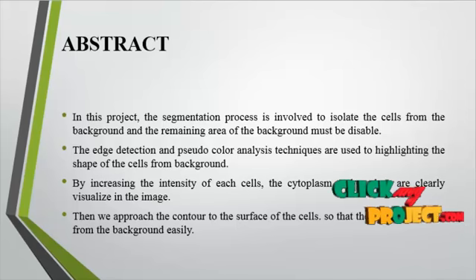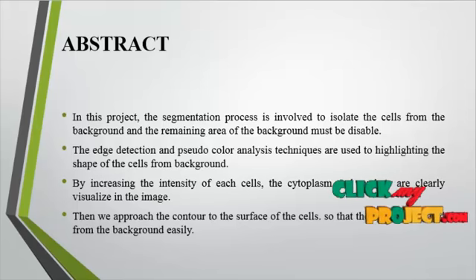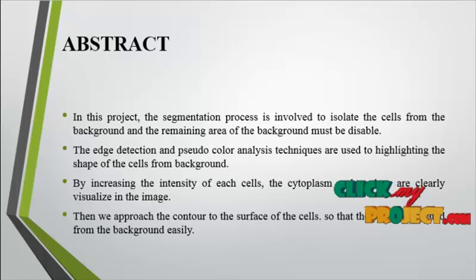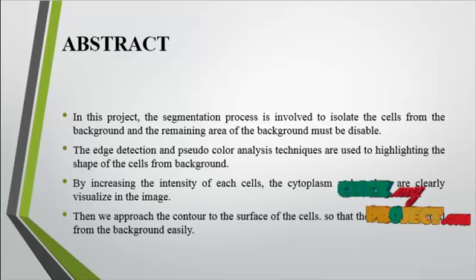The proposed method is feasible and effective for cell segmentation as well as cell classification. The segmentation process along with the classification gives more stability to the process. We evaluated the results of segmentation and classification, which provide the best result in medical science.